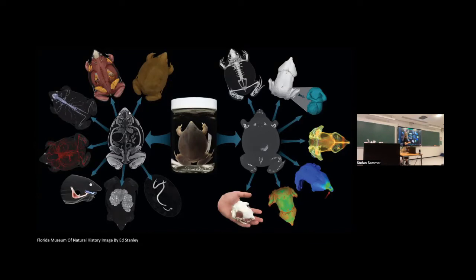It's really available. We can look at diet, we can look at parasites and reproduction and all kinds of stuff. And we're starting to look at soft tissue. You can trick an X-ray into attenuating soft tissue by bathing it in some kind of metallic solution, so that the tissue becomes more dense. So I think we're getting better at all of these things.